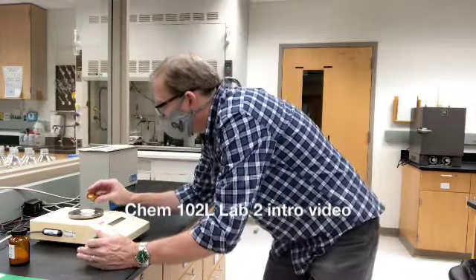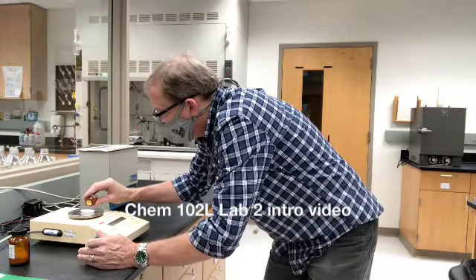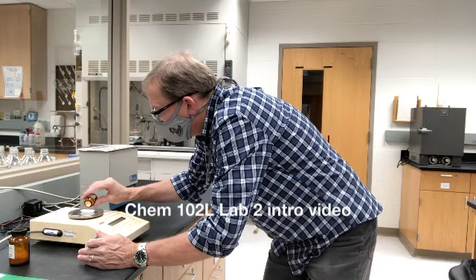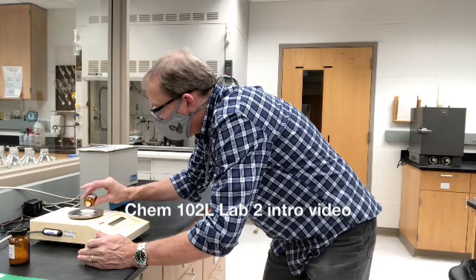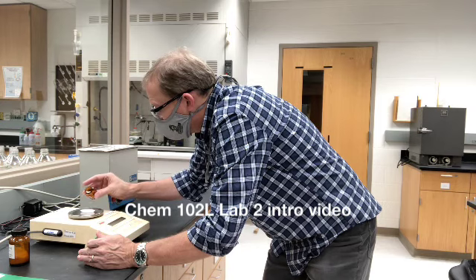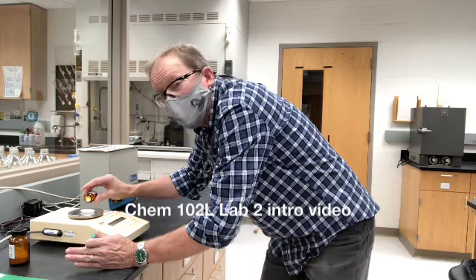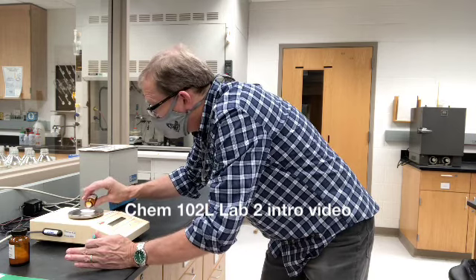So maybe it'll pour more nicely. So I'm going to tap to allow some of this solid to go in. And I have to wait and see what the result is. So I'm at 0.08. I want more than that.